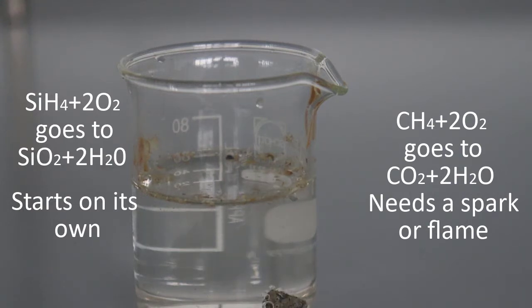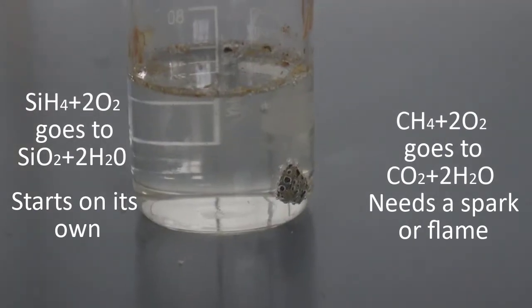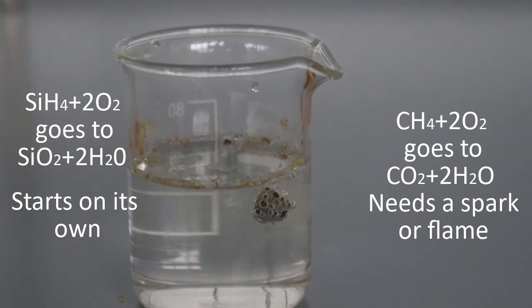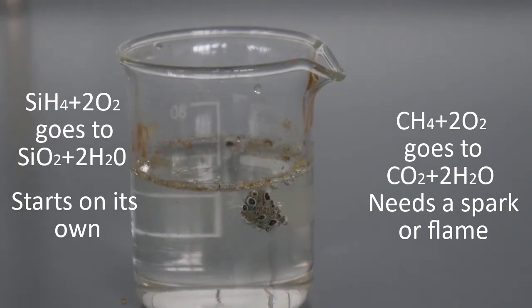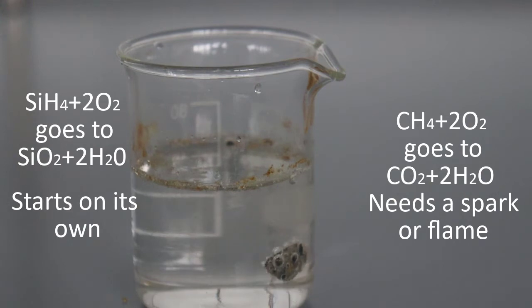And all of the other things are much the same. So the only major difference is just the energy required to start it, and it really comes from the bond between the silicon and the hydrogen being easy to break, which it happens in this case just with the heat. There's no light involved. We'll let it go a little bit longer and I'll put the equations here.